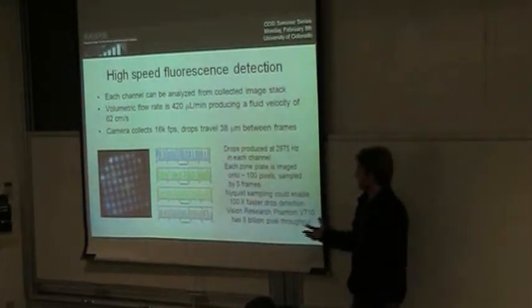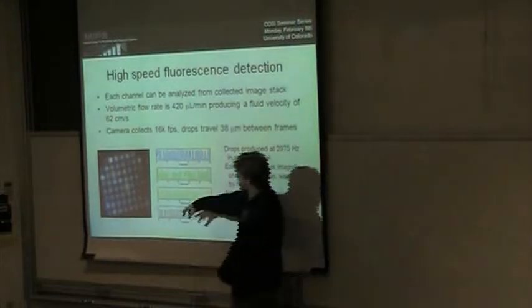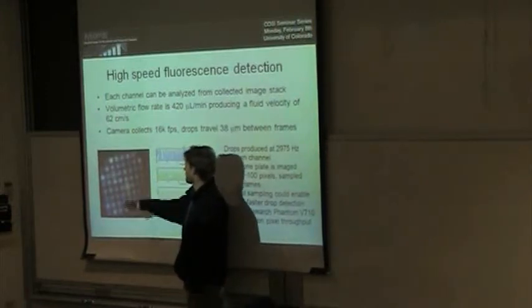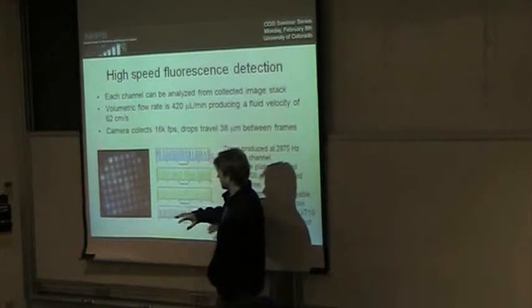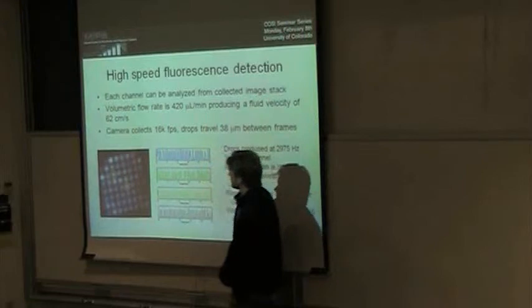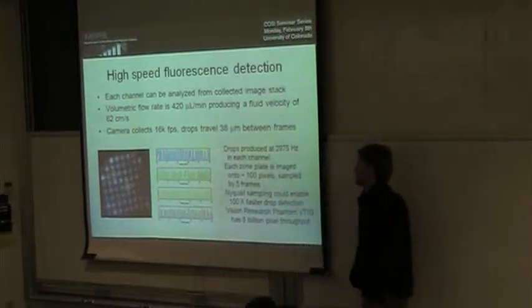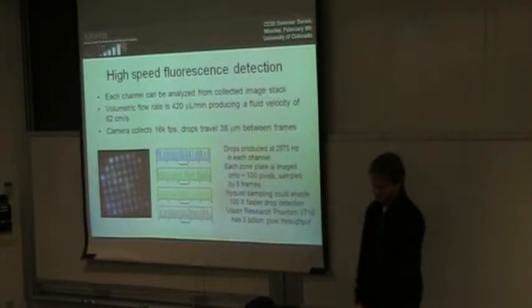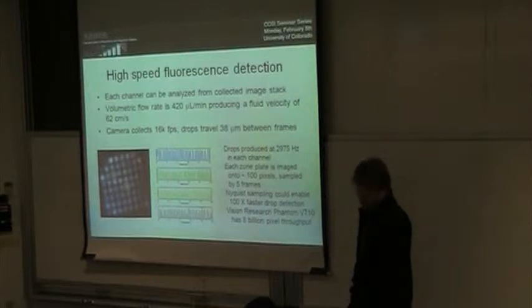I think we were collecting 100 million pixels per second, but these cameras can run up to several billion. So if you stuck a single pixel on each zone plate and then had a dark one in between for Nyquist, and these drops are nice because they're very periodic, so you can also sample in time at Nyquist. You could potentially build a system that could measure getting close to 1 billion entities per second if you were trying to do Nyquist in all those 3 dimensions.